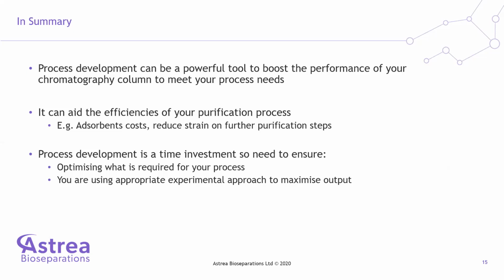However, process development is a time investment, so you need to ensure that you are optimizing what is required for your process and you are using the most appropriate experimental technique to maximize your output.